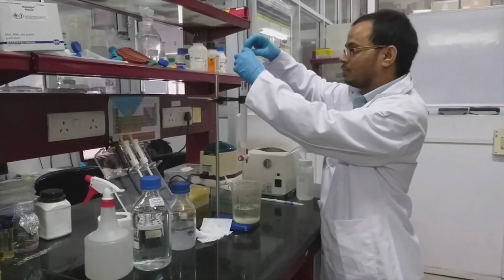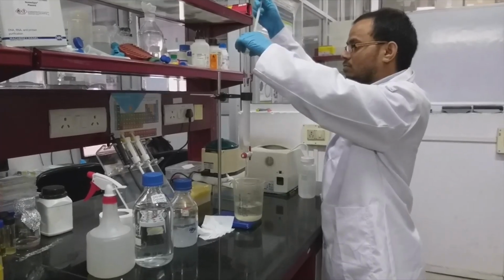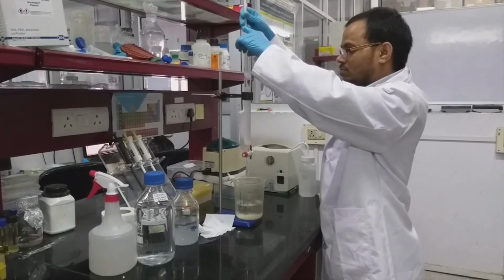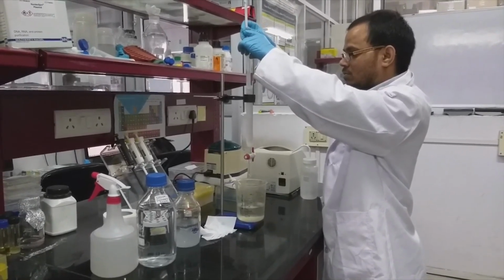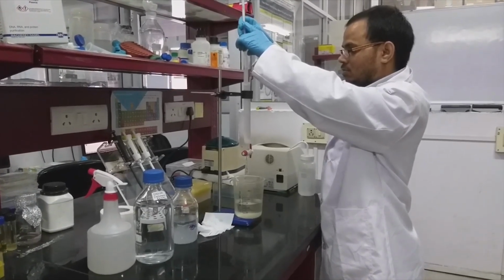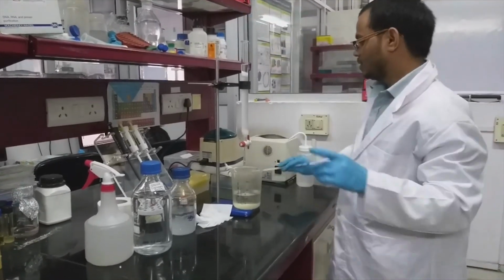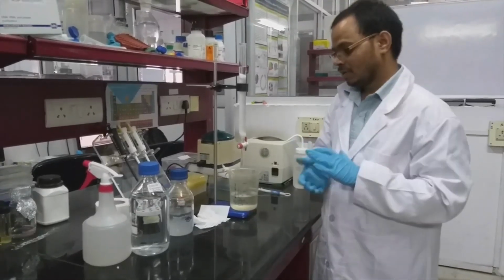So I am going to keep this one. So next step is we have to load the sample.